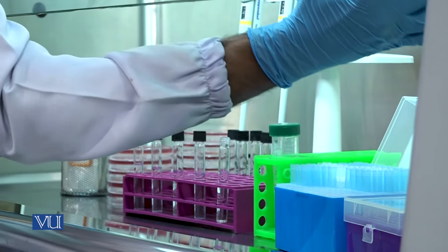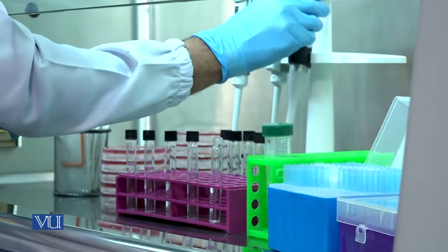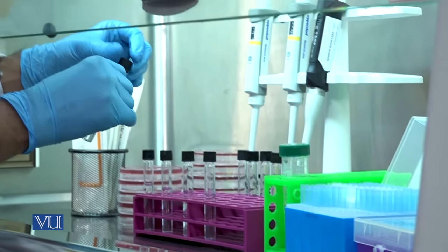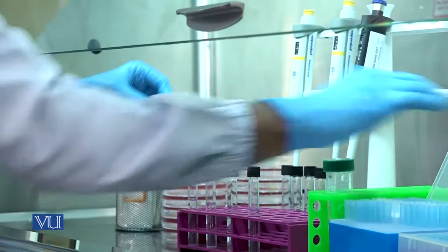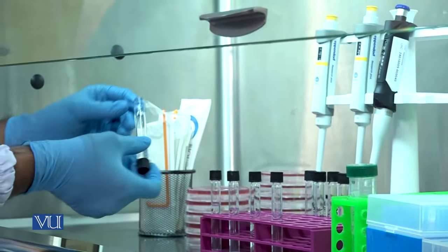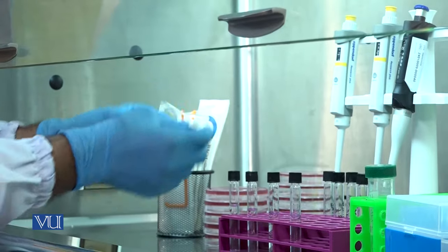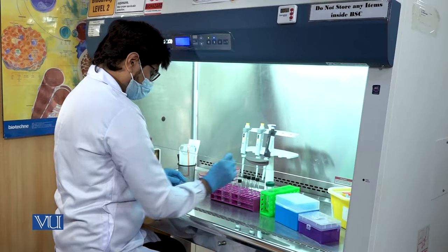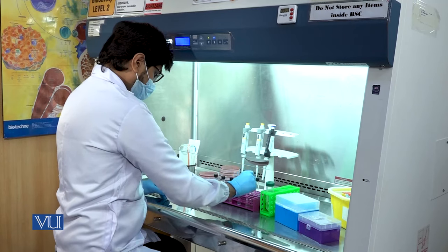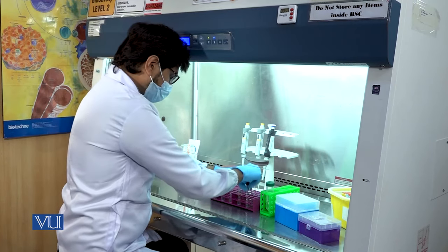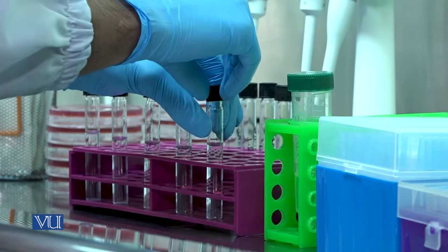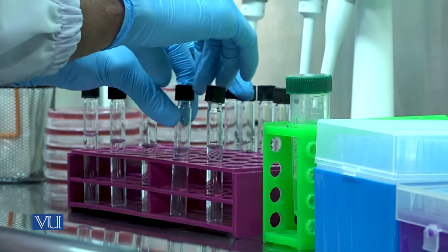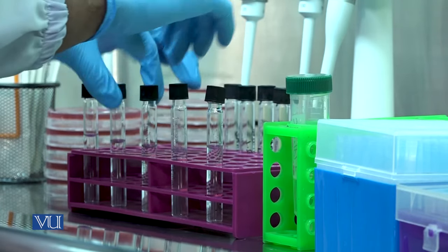Discard the pipette tip and tightly close the glass tube to mix the content. After mixing, put the glass tube back into the rack and loosen the caps of the remaining glass tubes containing 0.9 percent sterile saline solution to make further dilutions.